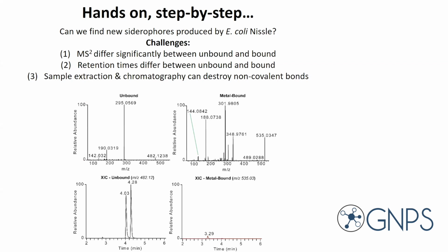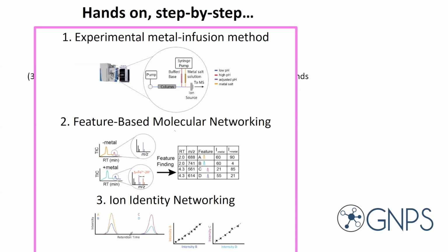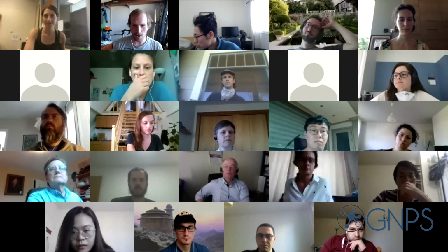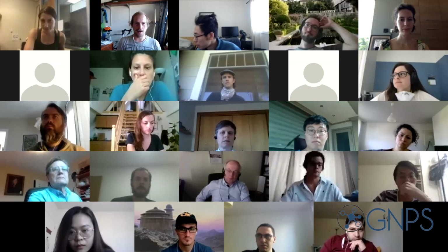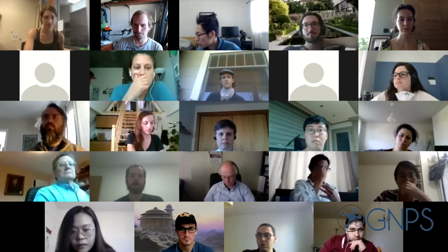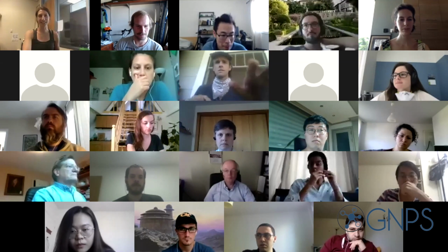So in this case, we had iron addition experiments. And then we're excited to see what compounds you will come up with. So I guess at that point, Allegra is going to take over and walk you through the download and visualization in Cytoscape. Okay, cool. Thanks, Daniel.